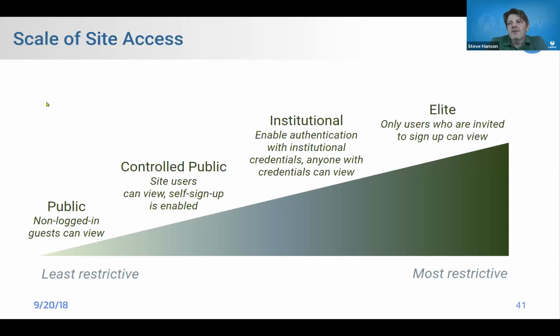That's when you're just going to hand out data to half a dozen people. You've got another PI you want to show something to, or the Nobel Committee that you want to show your data to. This is not public stuff. These are just some nice categories to keep in mind. There are really dozens of spots on this slope, but there are 4 important ones.